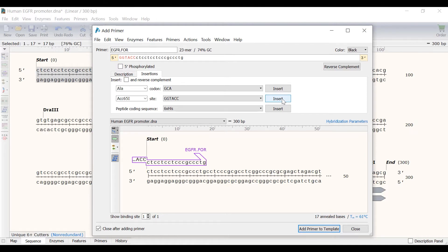Since some restriction sites do not cut efficiently at the end of a linear piece of DNA, it is recommended to add up to 6 bases to improve cutting efficiency. So I will manually add the sequence TAAGCA at the 5' end. To save this primer I will click on the Add Primer to Template button.